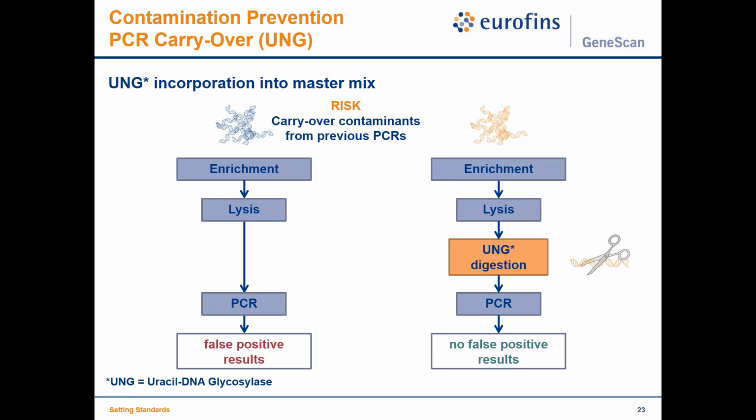protocol on the cycler, and you don't even notice it, but there is an initial digestion of these PCR amplicons in your PCR reaction, and then only the DNA that is coming from a natural genomic source will be amplified in the subsequent PCR. So this is a very, very good contamination prevention that hopefully no one ever needs, but if you need it, it's extremely helpful to keep your lab running.